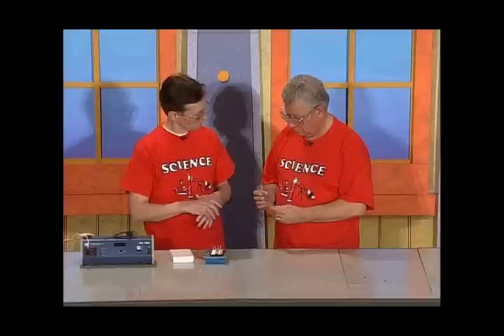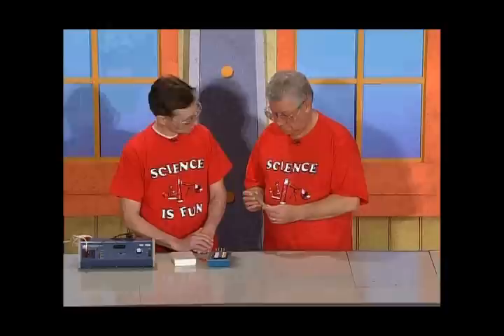I like what you said about it being useful, but you also said it's colorful. I don't see any color here. Well, you're right. This piece of niobium is just gray like every other metal. However, if we give it a very thin coating of niobium oxide, it will become colorful. So you say. Yes, well, I can show you.